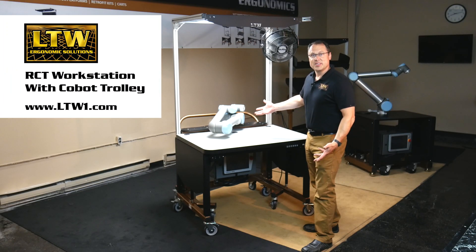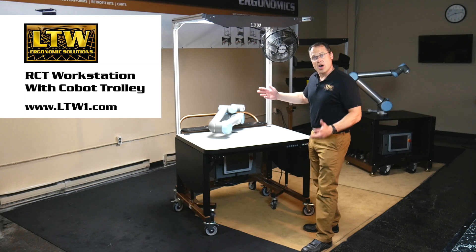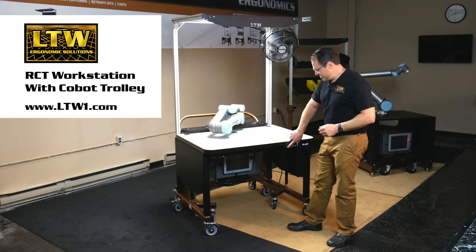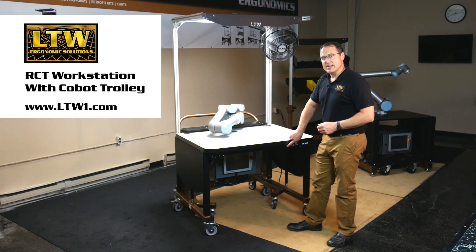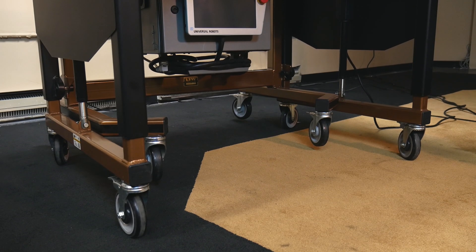That's how easy it is. We now have a universal robot docked into the back of our RCT workstation — all plugged in and ready to go. All we need to do is power it up. Just push an electric button and it raises up and down for different height operators.